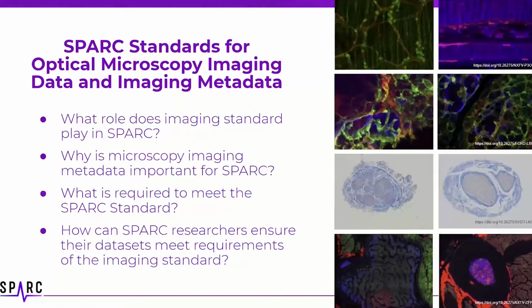That makes sense, and I could totally get on board with these standards, but Macy, can you tell me a bit more about why you think microscopy imaging metadata is important for SPARC? Yeah, without metadata such as the histological stain or fluorescent label of the channels or the physical dimensionality of the pixel or voxel, it's really impossible for one to fully understand, analyze, or reuse an image from a given data set. By enriching these image files with essential metadata directly, we can ensure the files include that relevant and critical information about the image itself, like what we're seeing in the image and how it was acquired.